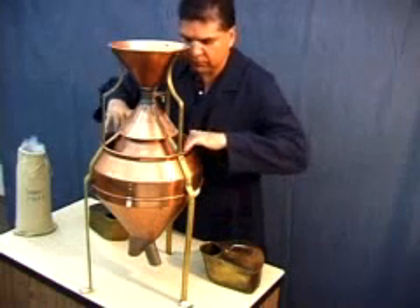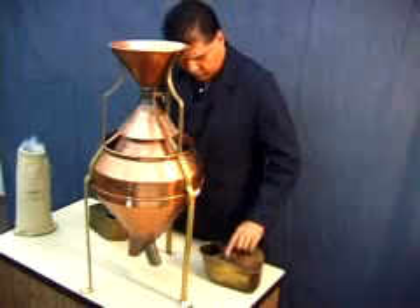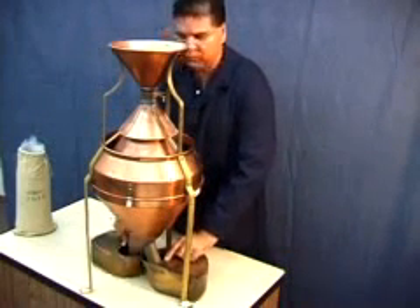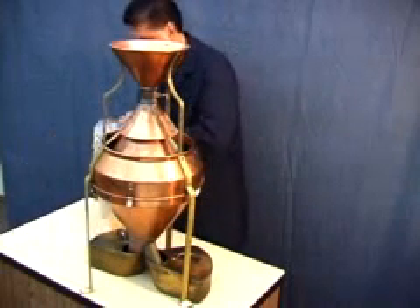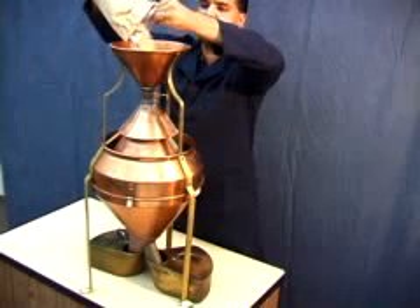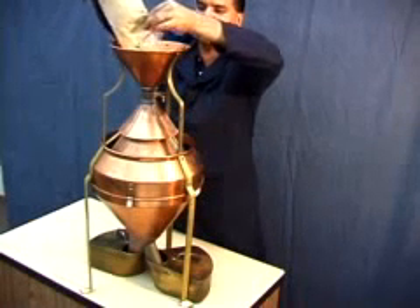When operating the Borner divider, check the divider for condition and cleanliness. Place empty collection pans under the discharge spout. Close the hopper valve. Pour the sample into the hopper. Open the valve quickly.